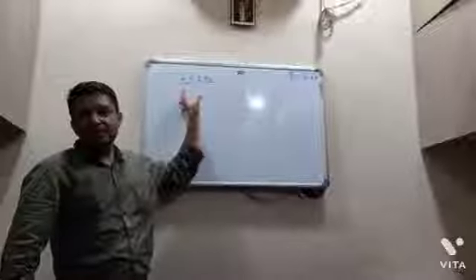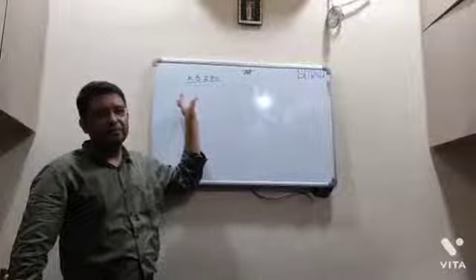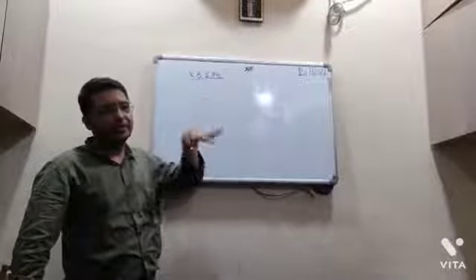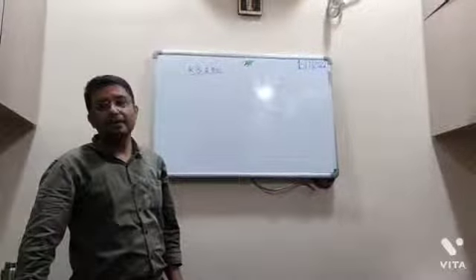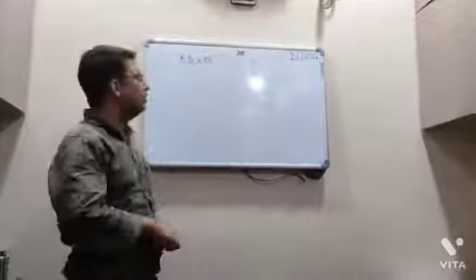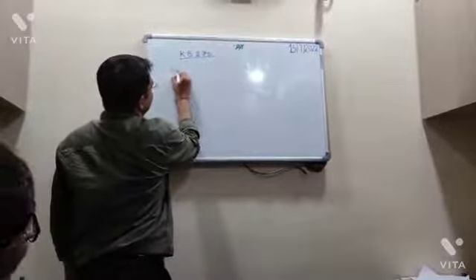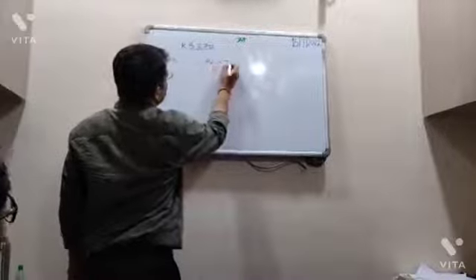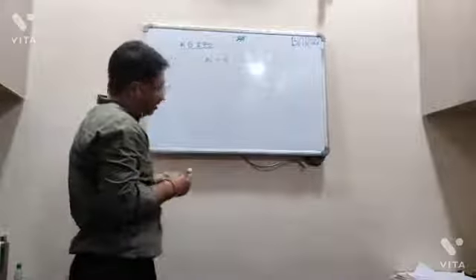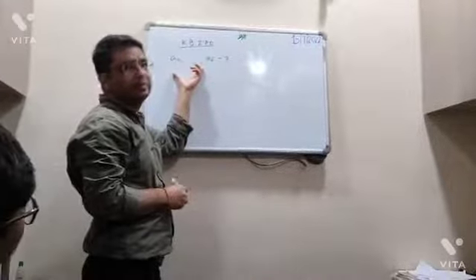So what we are going to discuss regarding KB-270, and in KB-270 what was our question? Regarding coefficients, right? So how many coefficients are here? It is having A0 to A6, which means a total of 7. Now the question was, from where have these coefficients come?